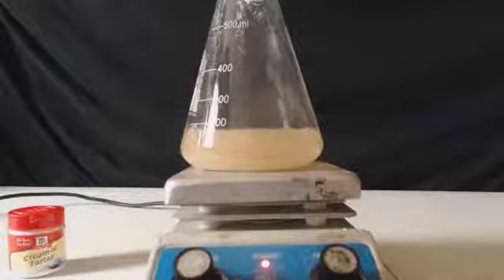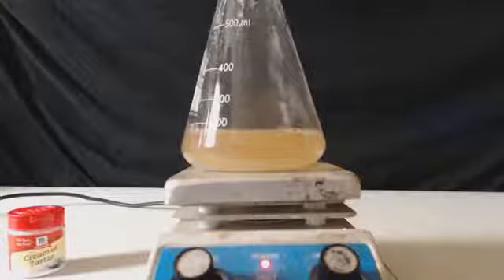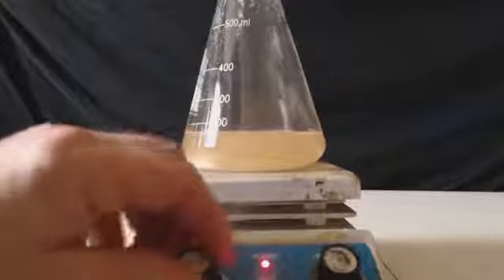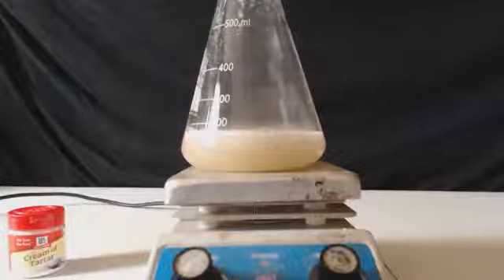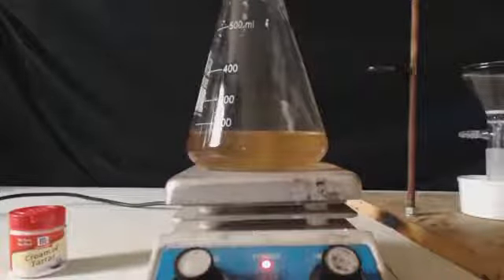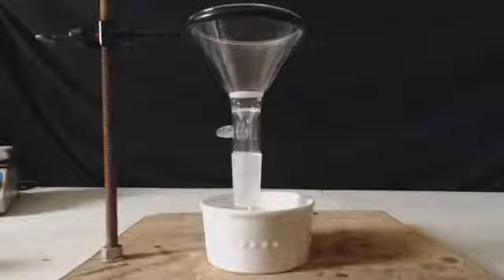It didn't really bubble a lot there. So it must be close to being done reacting, because otherwise it would bubble a lot more than that. So I'm going to stir this up for a little bit. As you can see, everything's dissolved. It did turn it brown, which I don't like. So I'm going to filter it.